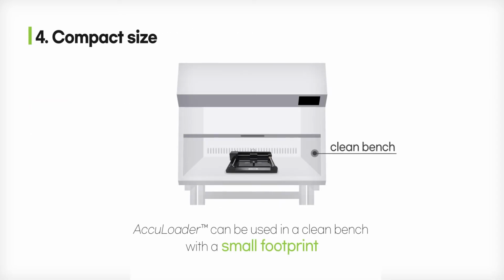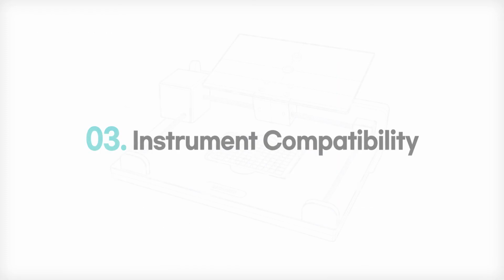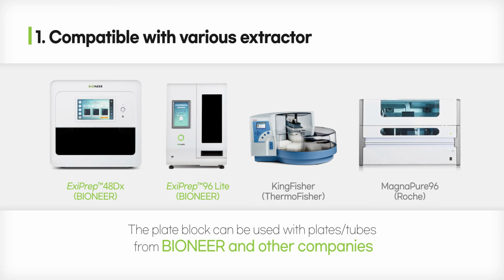Finally, AccuLoader has a small footprint, allowing it to be freely placed in a clean bench. AccuLoader can be used with a wide range of instruments. Its plate block can fit plates and tubes from BIONEER and other companies.